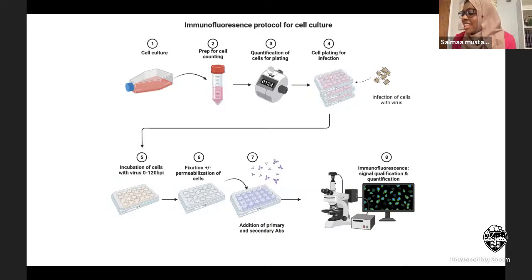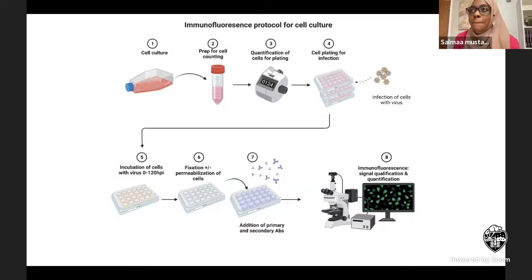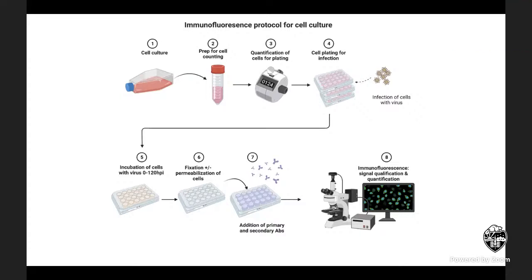Thank you, Dalia. Then we have another question about the dilution of the antibody. Do you just follow the manufacturer, or do you also do optimization? Yes, you have to do optimization. Sometimes you see papers that say, oh, we used 1 in 200 or 1 in 50, but that doesn't mean it would work for your own cells.